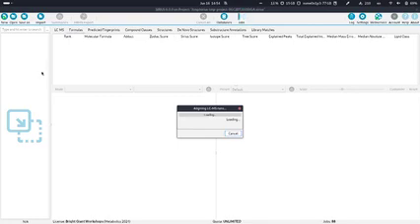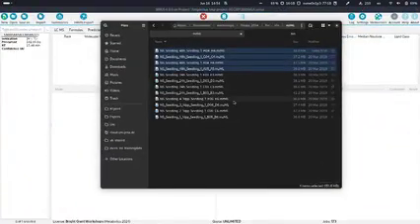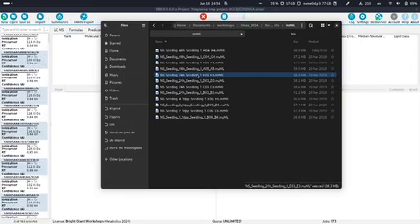So instead of using the drag and drop, you can just use this import button. For example, maybe for some reason drag and drop isn't working, you can just use this import button at the top. Okay, while it's aligning and doing everything, I just want to show you one quick thing, and that is, especially if you've measured some data and you try to load it into SIRIUS and nothing is happening, it's always a good idea to just look at your data first before doing anything else.